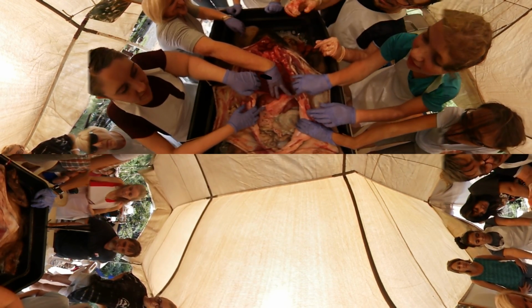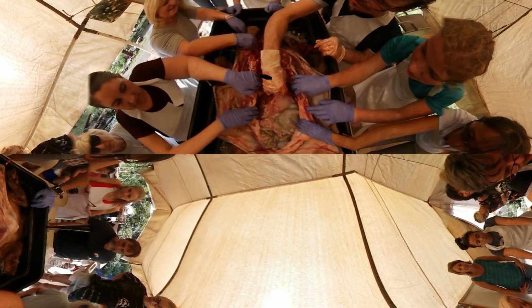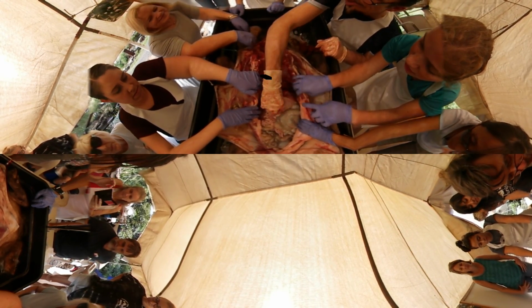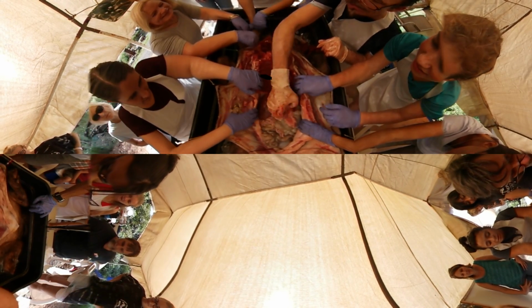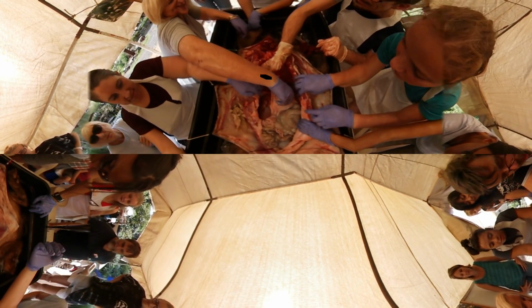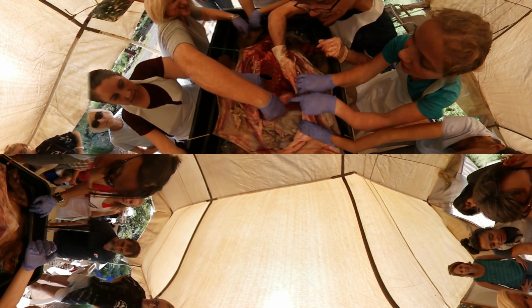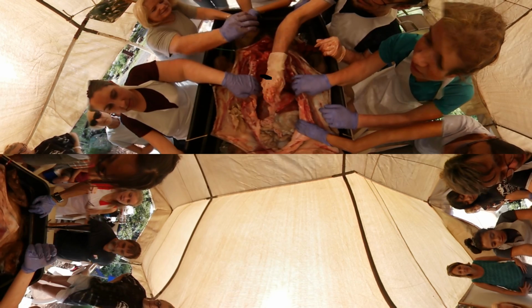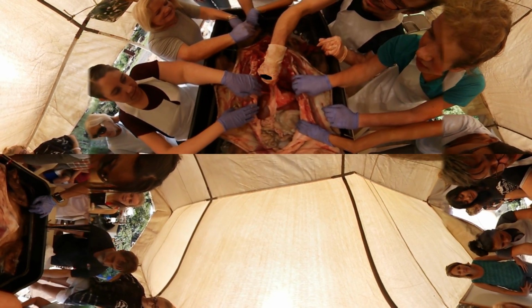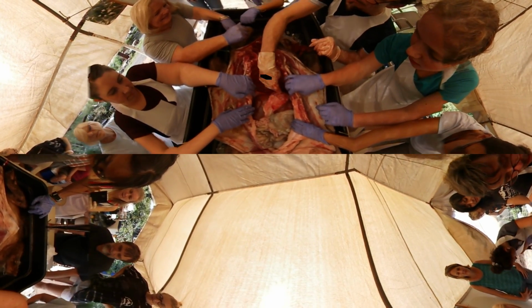What's beside it? There's this all over it. That's a kidney. That's the liver. Okay, so I've taken this, what's this connected thing? This is the spleen. We'll talk about the spleen. Now this thing is not the stomach, but it's all over the stomach.